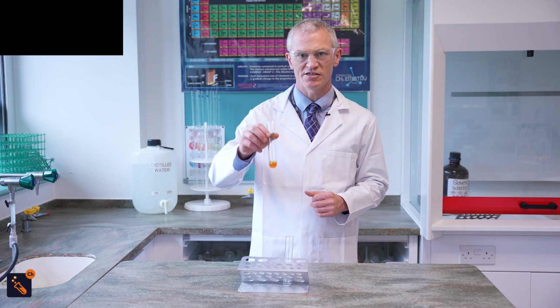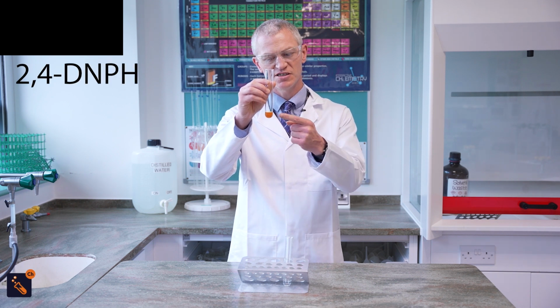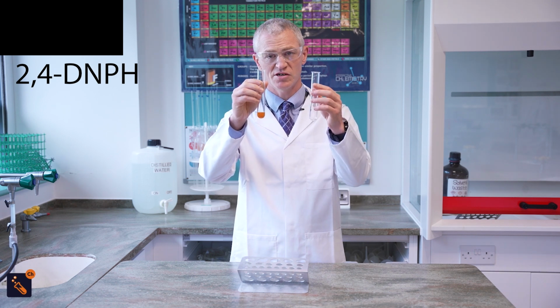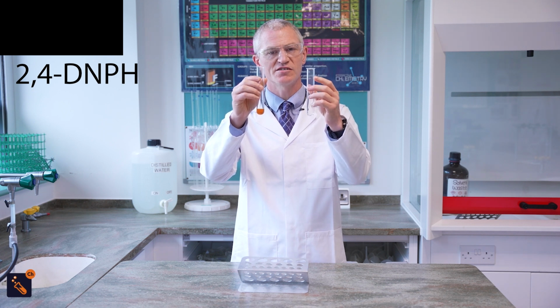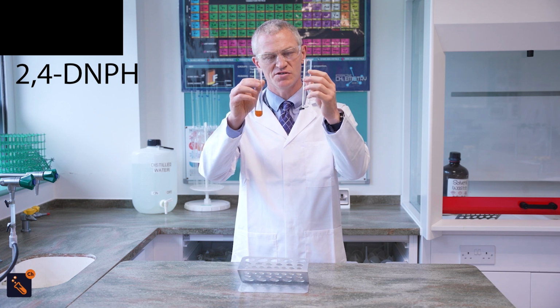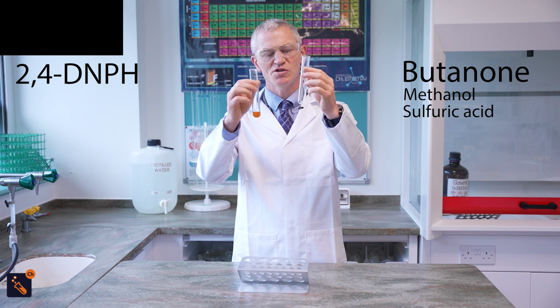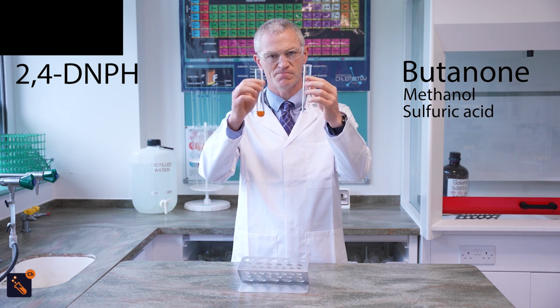Now 2,4-DNPH is in this boiling tube here. So you can see it's a very orange colour, unmistakable. And we're going to add it to a ketone. So when I say carbonyl, precisely, this is a test for a carbonyl that occurs in a ketone or an aldehyde. So we've chosen a ketone to put in this boiling tube, and that is butanone. And we've also put in the other two reagents, which is methanol and sulfuric acid. And together this is known as Brady's reagent.